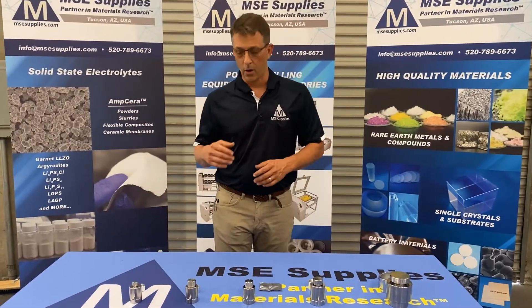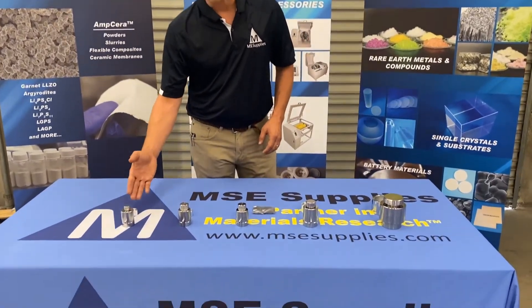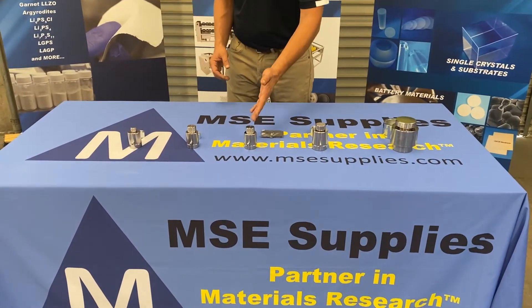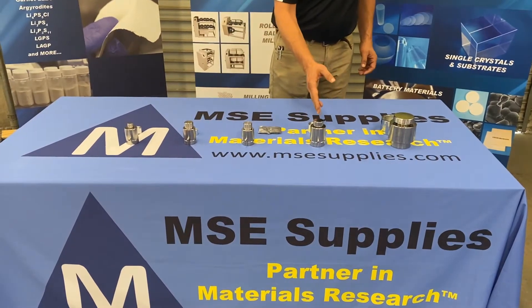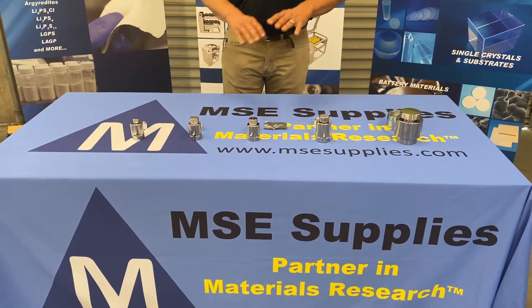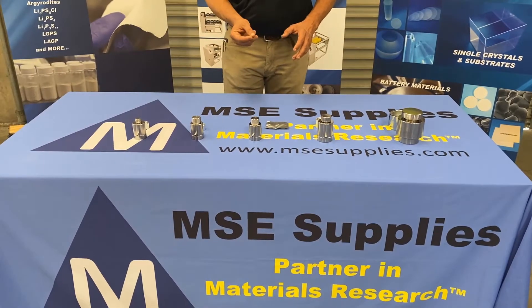Today we're going to be talking about the pellet pressing dies. We offer five different sizes. They range in size from the quarter inch or six millimeter, the 0.4 inch or 10 millimeter, the half inch or 12.7 millimeters, the one inch or 25.4 millimeters, and the big one, the two inch or 50.8 millimeters. All of them are set up — with the exception of the two inch — for vacuum pressing as well.